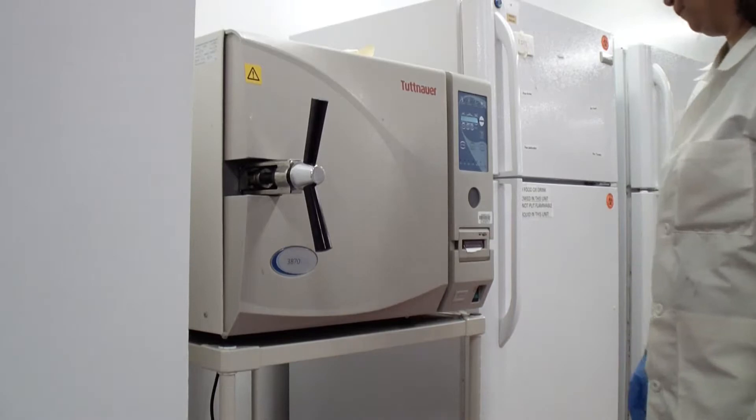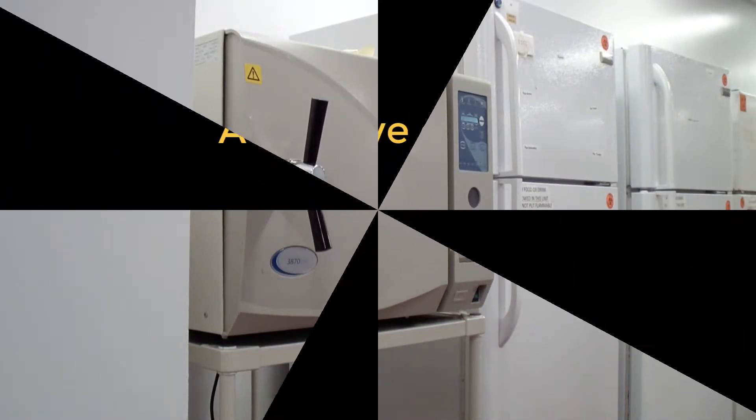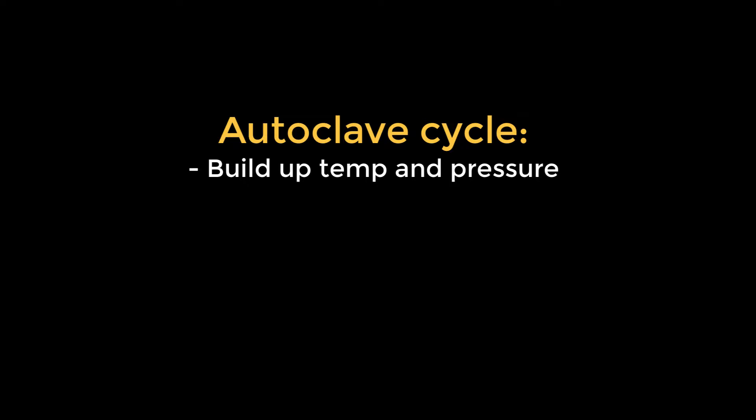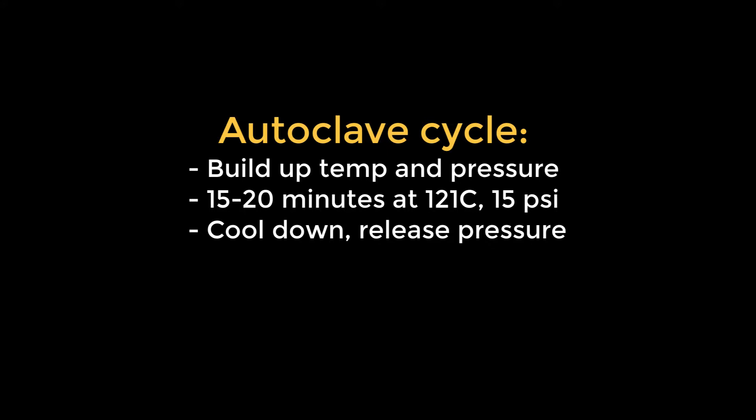Then the autoclave is started. It takes about an hour and 15 minutes for one complete cycle of building up pressure, 15 to 20 minutes at 120 degrees Celsius, 250 degrees Fahrenheit at 15 psi, and slowly decreasing the pressure again.